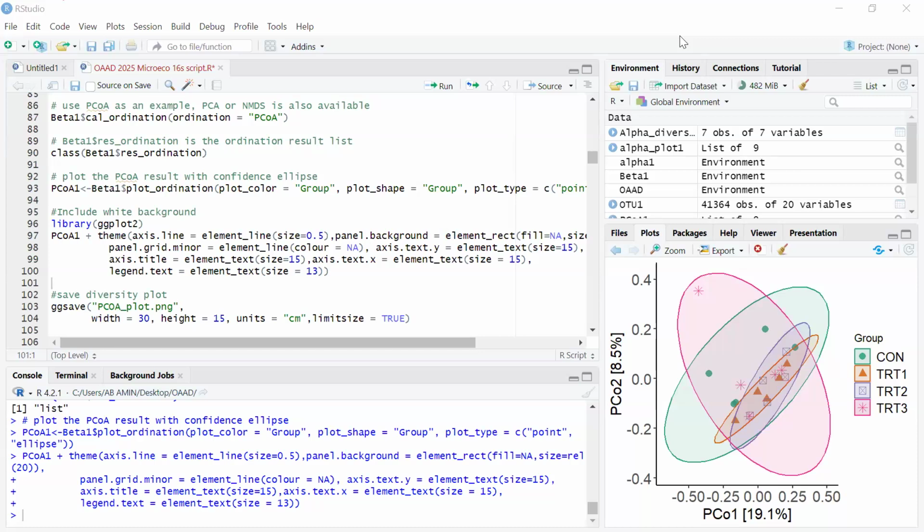These dots are not individual bacteria or taxa. They are replicates, so the replicates of that particular group are far away from each other and have high diversity. That's why the distances are far apart. It was calculated based on Bray-Curtis distance.